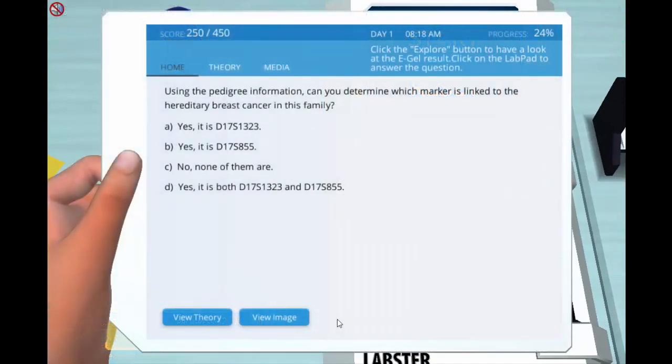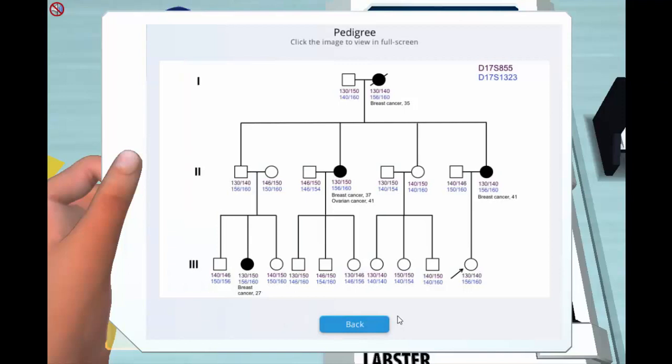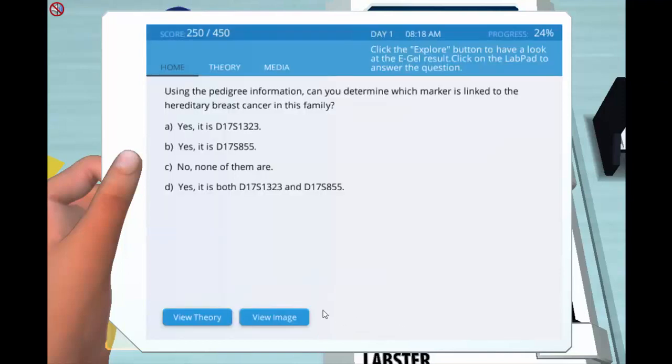Analyzing the genotypes from family members, students determine which gene is linked to hereditary breast cancer in this family.